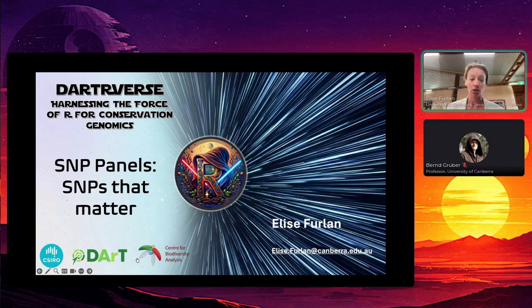So this session is going to go through where SNP panels can be incredibly useful and make sure that you're going to be able to select your SNP panels appropriately to address various genetic conservation research questions.